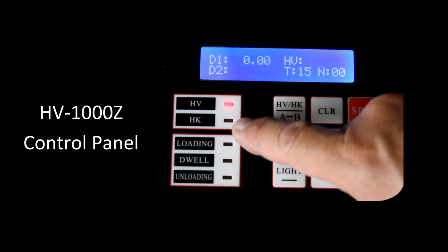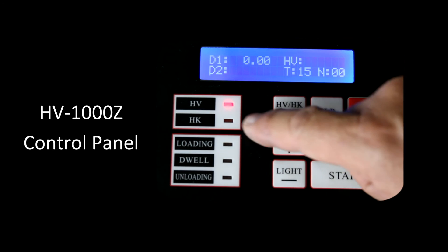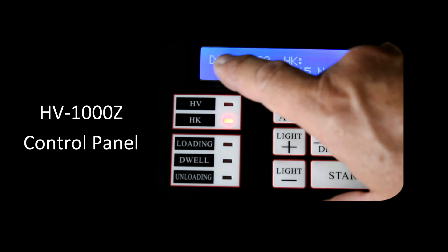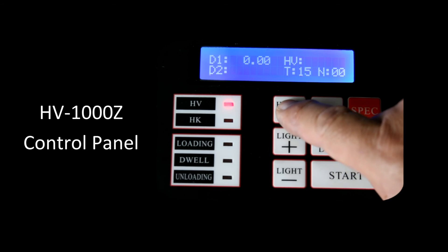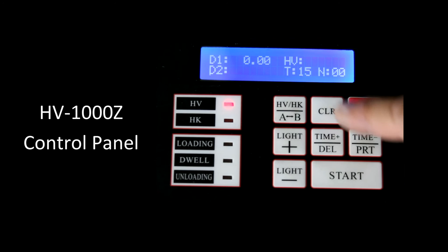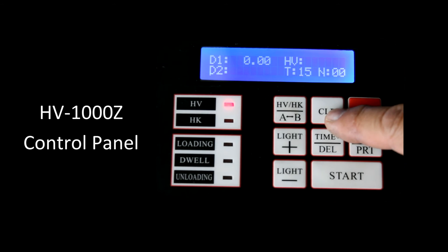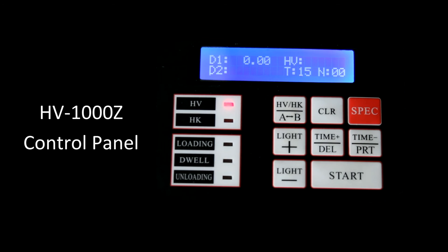We can measure Vickers or Knoop depending on the indenter we have. For Vickers, we have a D1 and a D2, so we're measuring two different diagonals. To change to the different indenter type, we have an HV/HK button. If we press that, we see just one measurement to make and the light is lit for the Knoop indenter. Let's go back to micro Vickers. We can add or decrease the light seen through the filar. The time plus and time minus buttons are for dwell time — we can increase or decrease it. The clear button is used to zero the filar: bring the filars together and press clear, and it zeros out the calibration.